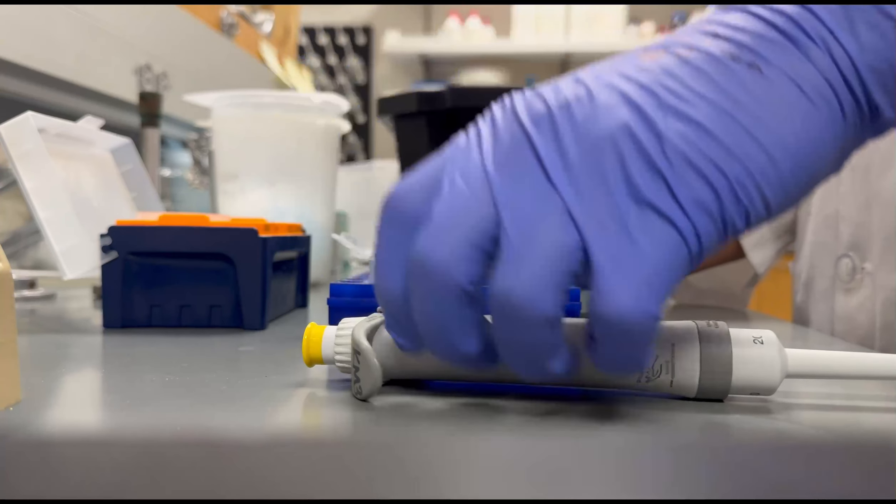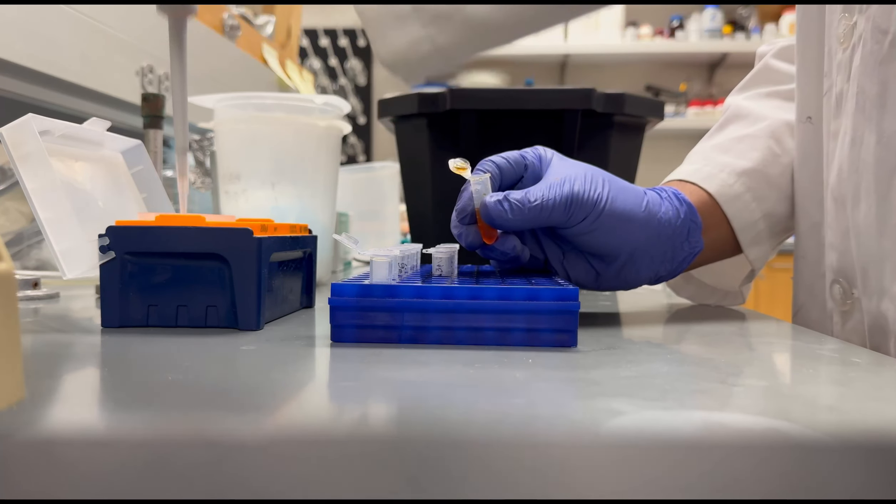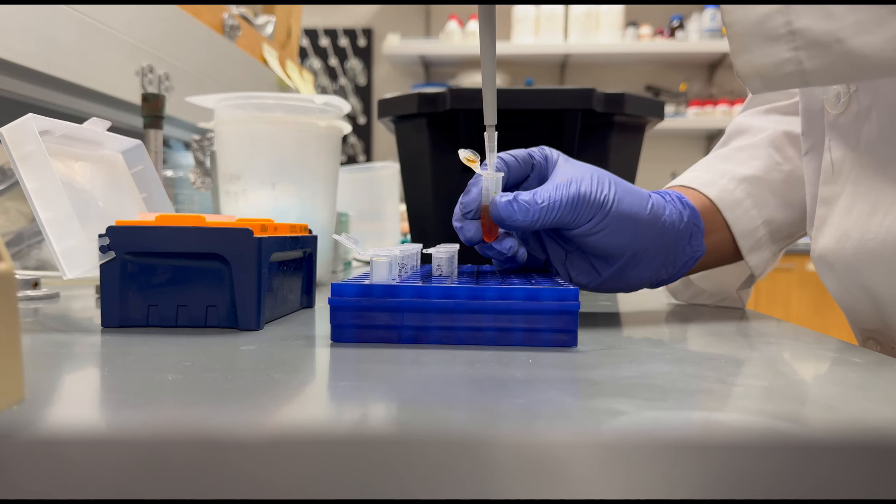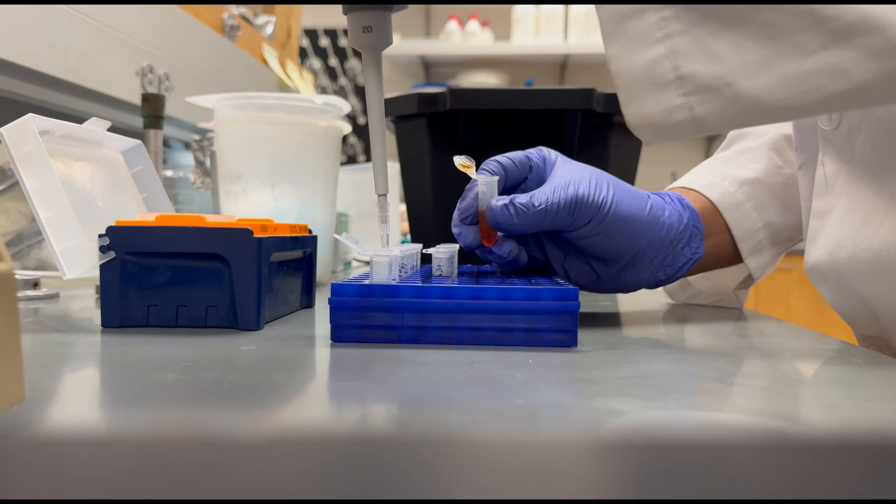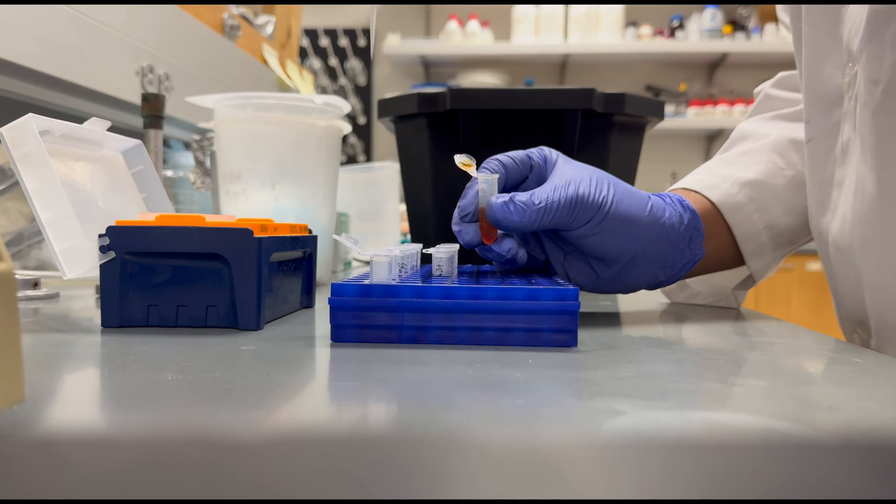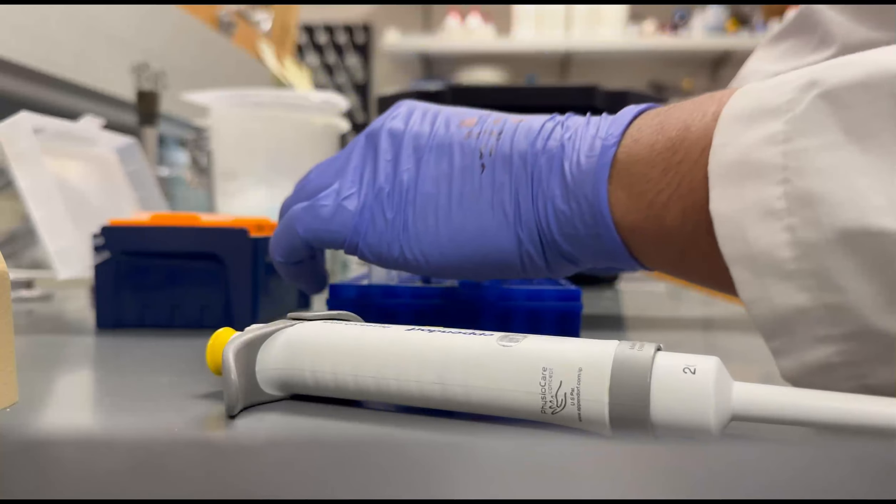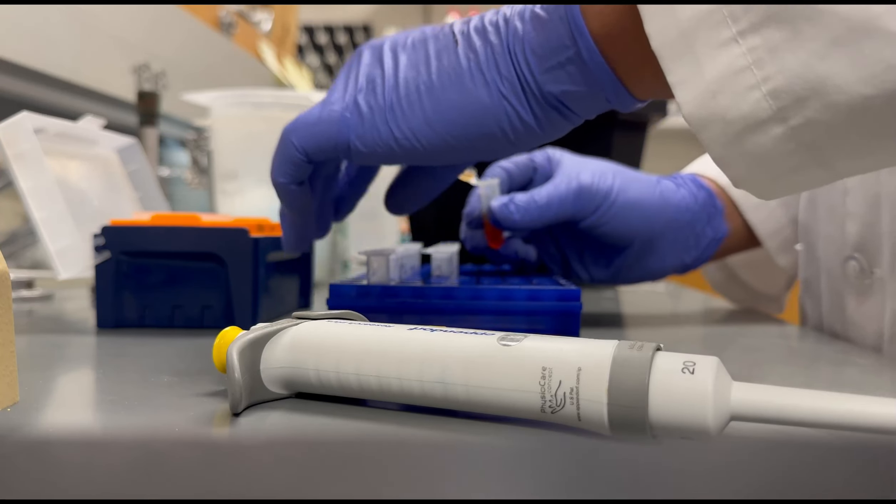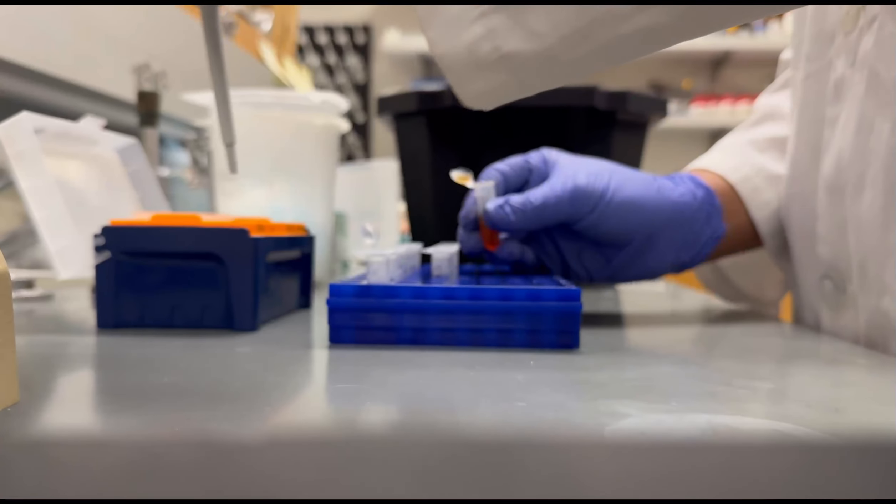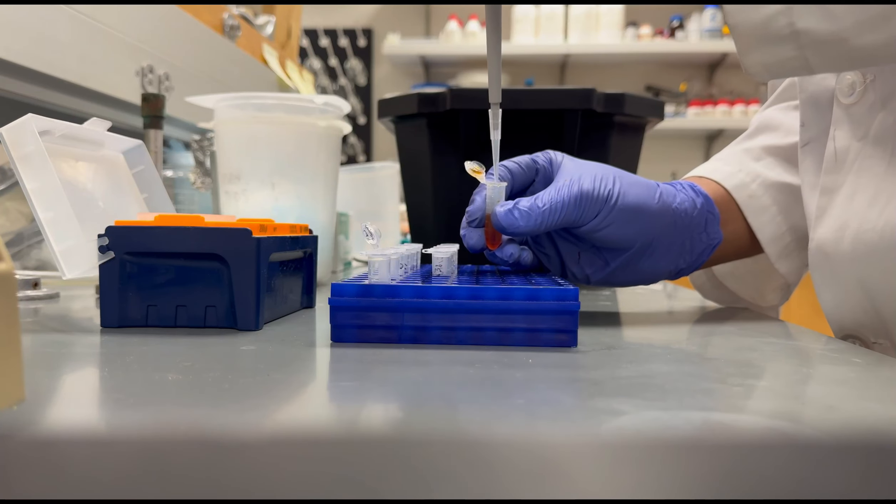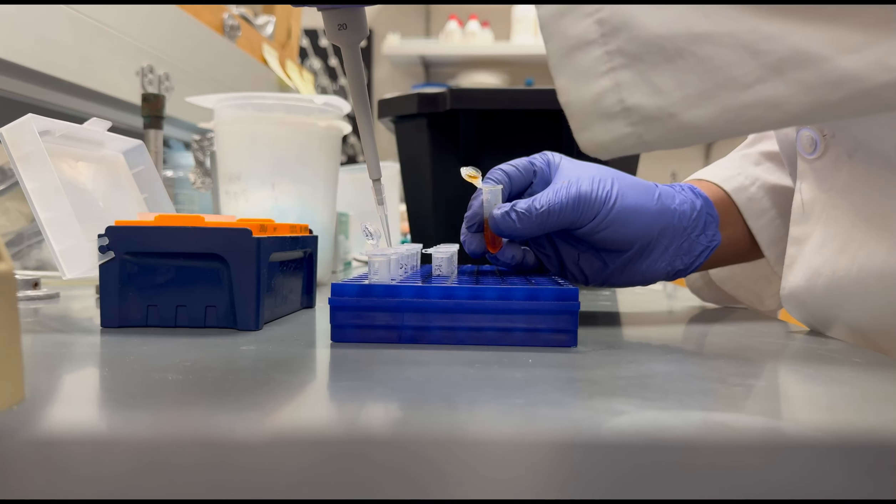The samples typically included are a crude sample after sonicating for purification, a clarified lysate sample taken after centrifugation, a sample of the flow through before running through the affinity column in the HPLC, and finally a few samples taken during the purification process using the size exclusion column.